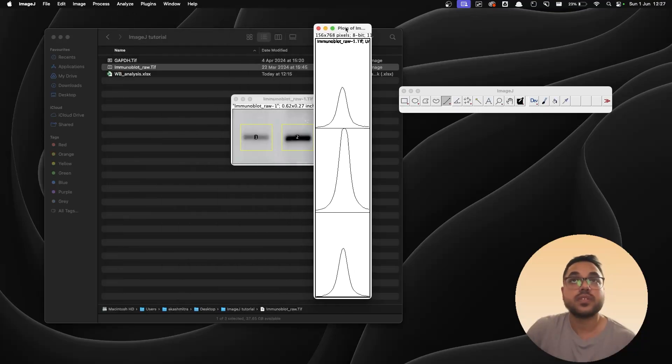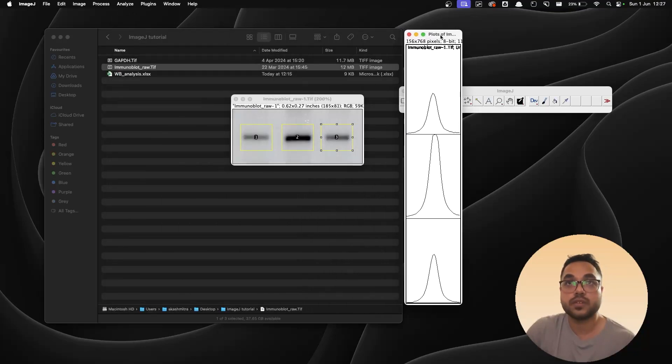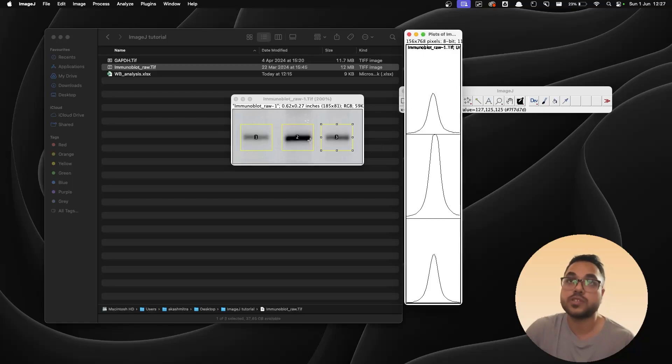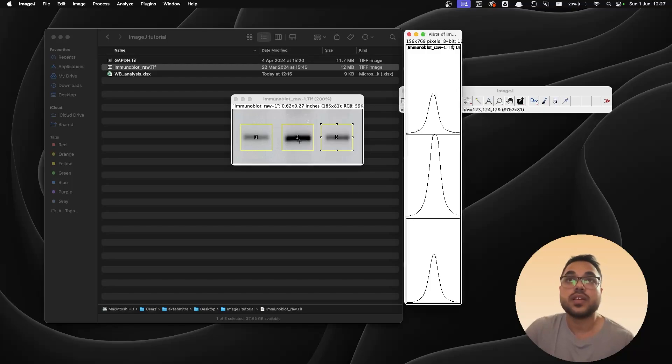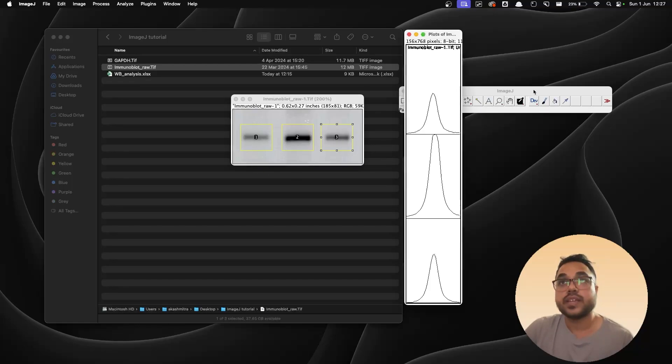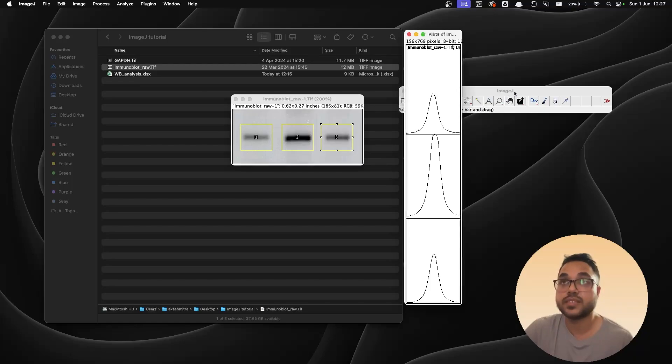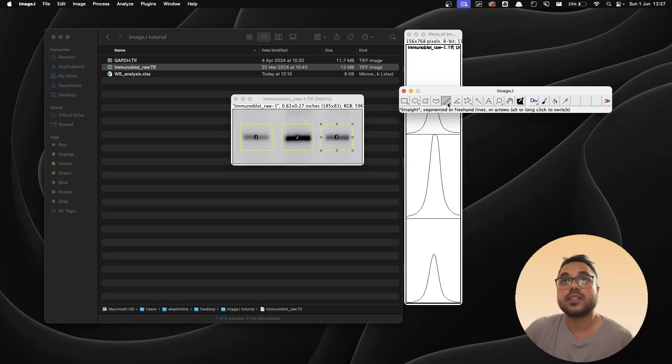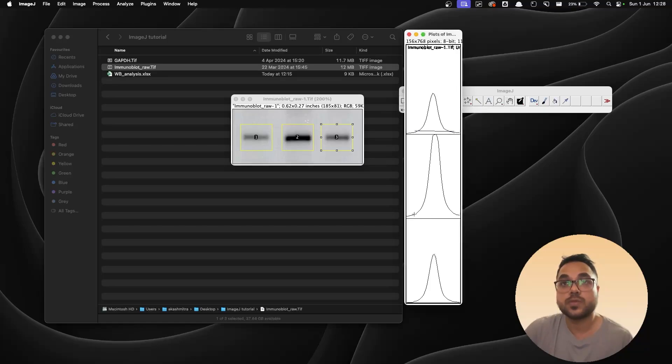And you have these peaks appearing corresponding to the lanes of the blots that you have. You can see the second one, the peak is very high because the blot over here is very intense, and the first and the third one they are shorter than the second one because those are lighter in intensity. Next what you need to do is you need to analyze the area under the curve or the area under the peak for calculating the intensity or the density. So to do that, take the line tool and just draw a line depicting the closed area which you want to calculate. Do this for all of them.